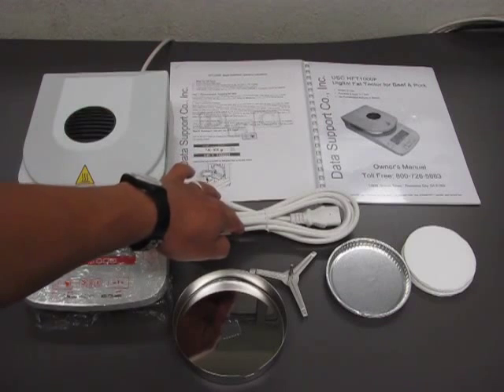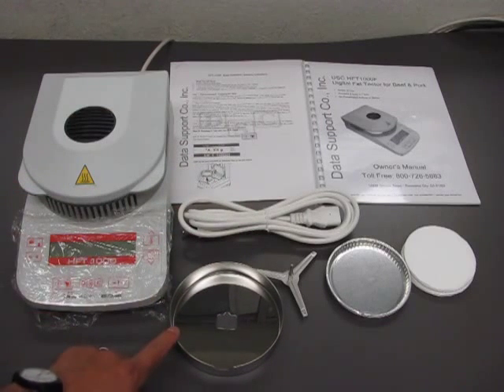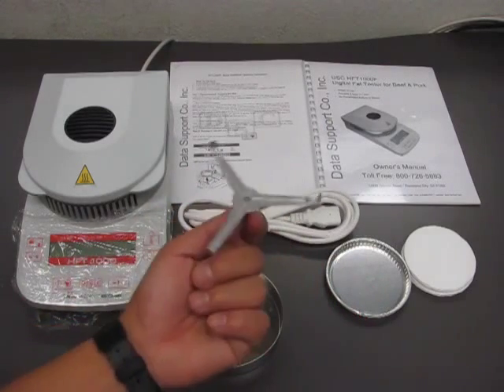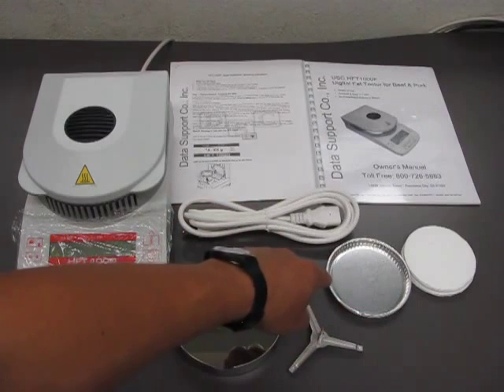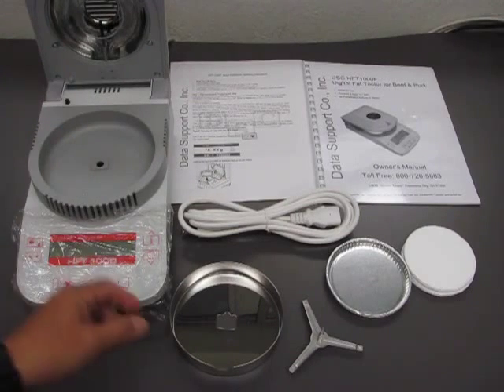The unit comes with a power cord and the drop shield — this is called the drop shield. This is the pan support, where the aluminum dish sits when you run a test. You will also have some aluminum dishes and the sample pad.